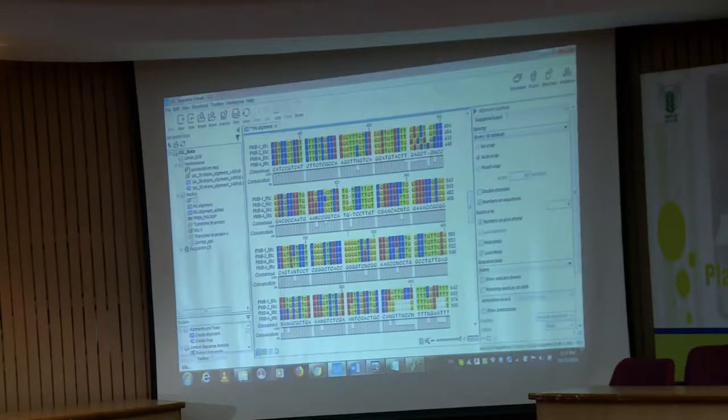Now, what happened? That C has been converted to G, but this editing you can do only after verifying from the quality of your chromatogram. Do not do the editing without any confirmation, otherwise you will spoil your sequence, right.